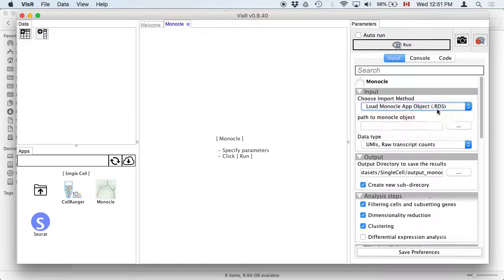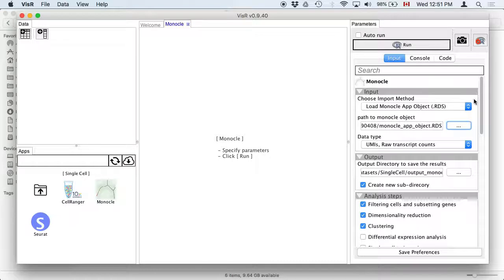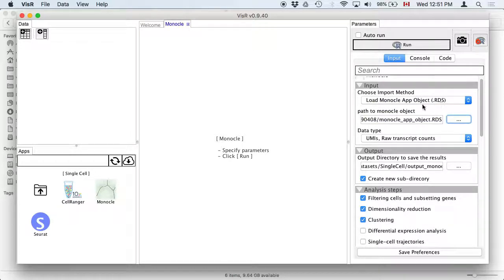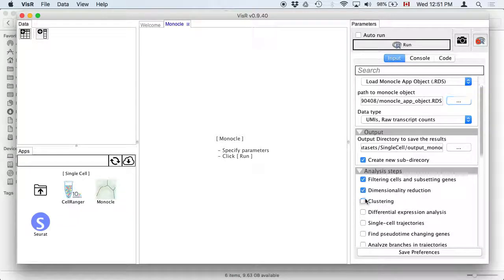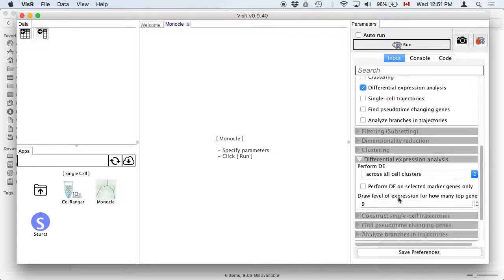If you already have an RDS file where certain steps are complete, you can tell the app not to redo those steps and only run, say, the differential expression analysis. You only need to specify parameters for that step. This is useful if you're looking at your plots and a threshold doesn't feel right — you want to redo that step and everything afterwards without waiting another hour for the pre-existing steps to re-run.